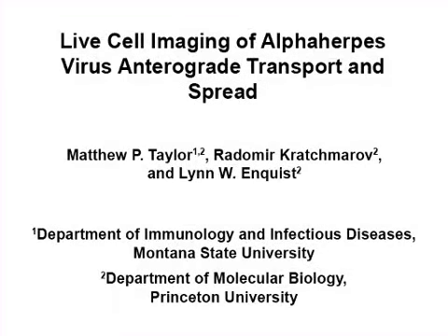The overall goal of this procedure is to visualize events of herpes virus transport and spread using fluorescent protein fusions in primary neuronal cultures.